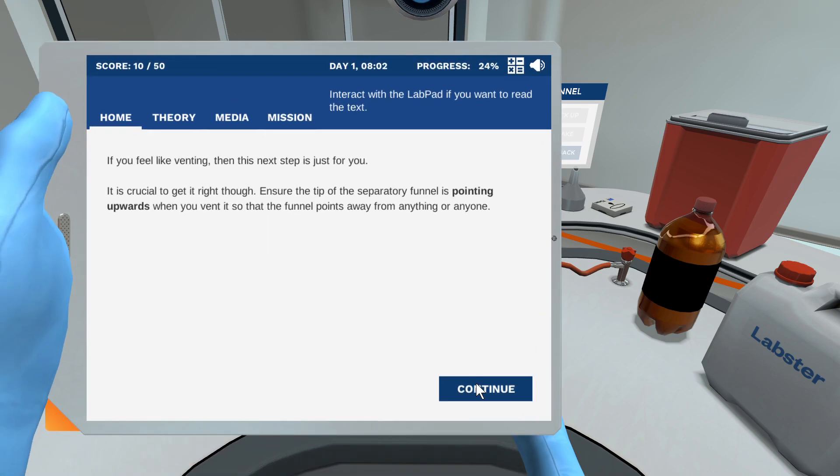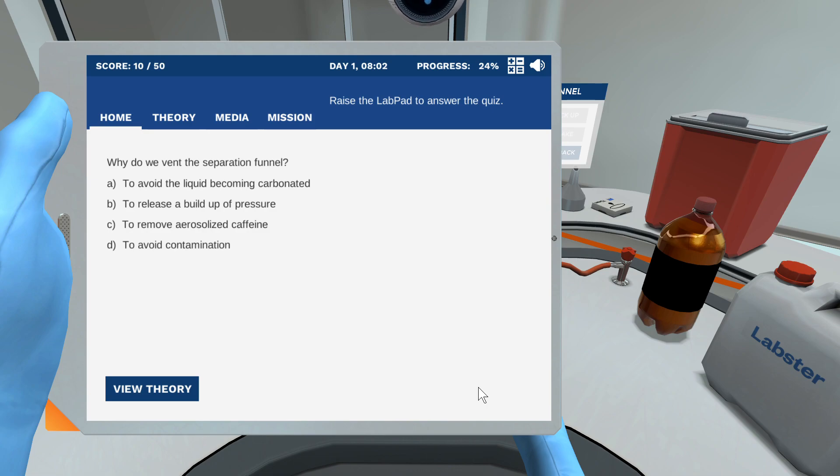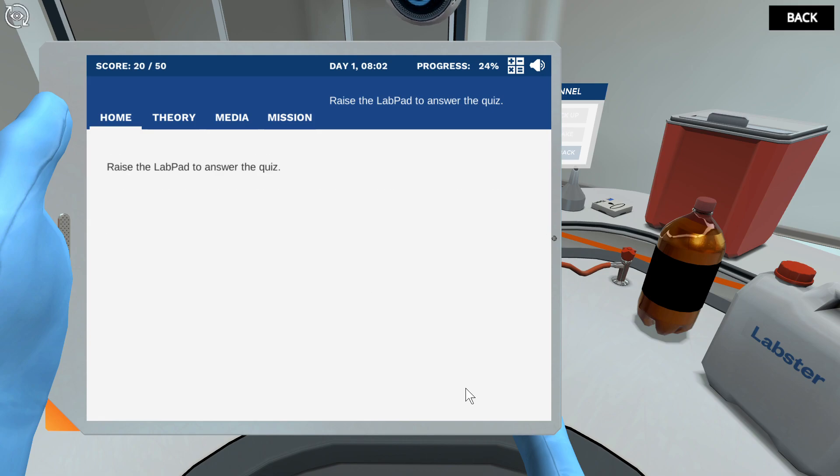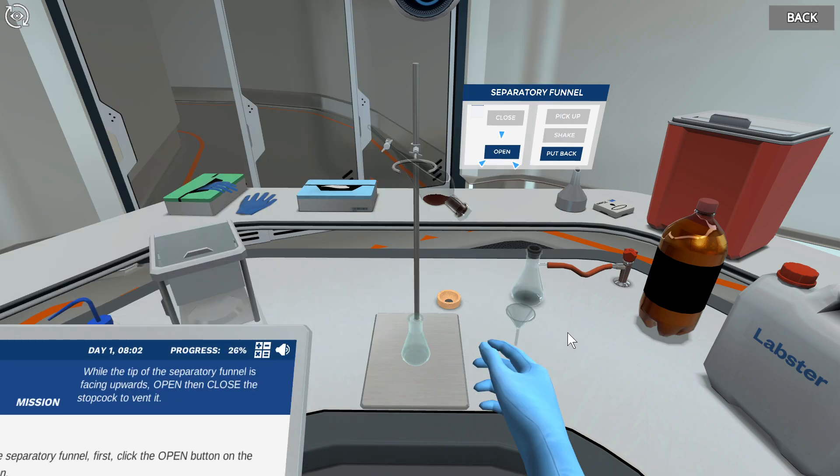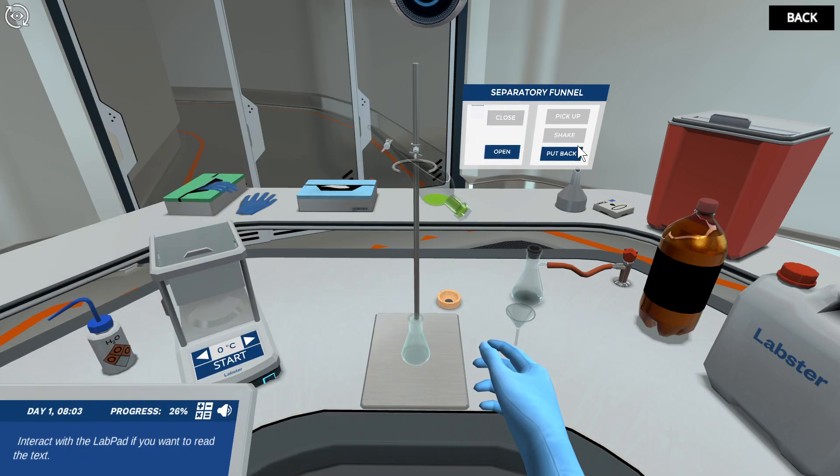If you feel like venting, why do we vent the separatory funnel? When we shake the funnel while the tip of the separatory funnel is facing upwards, open then close the stopcock to vent it. If left unvented, the buildup of gas in the separatory funnel could push out the stopper or spray liquid.